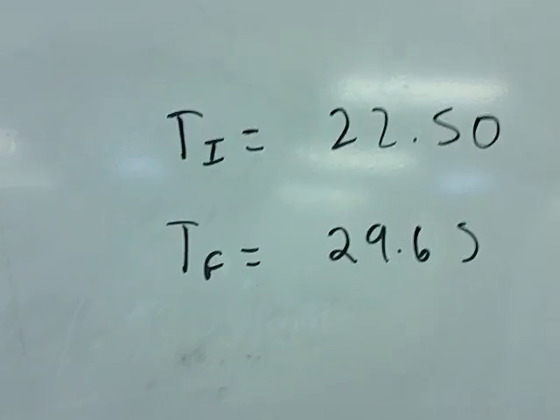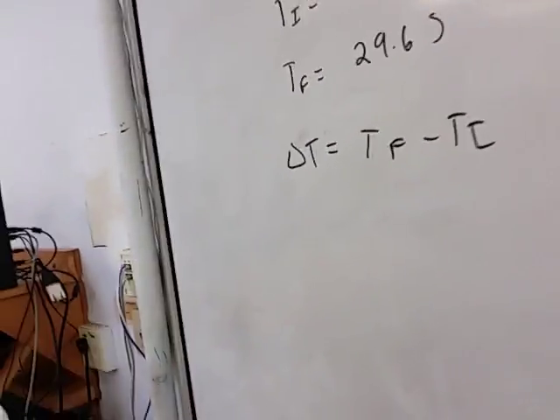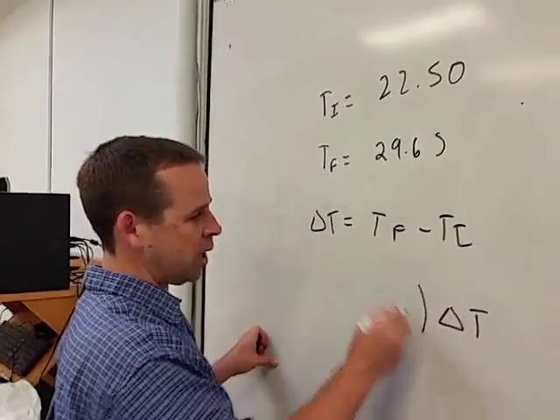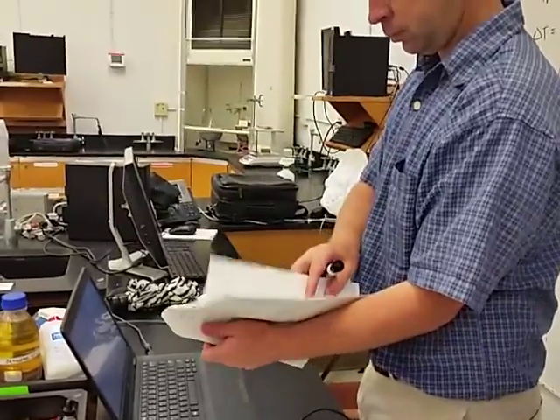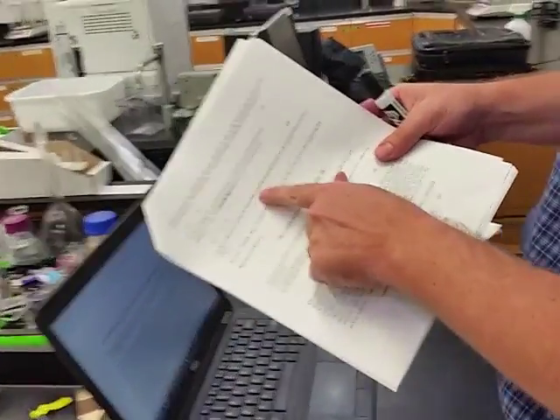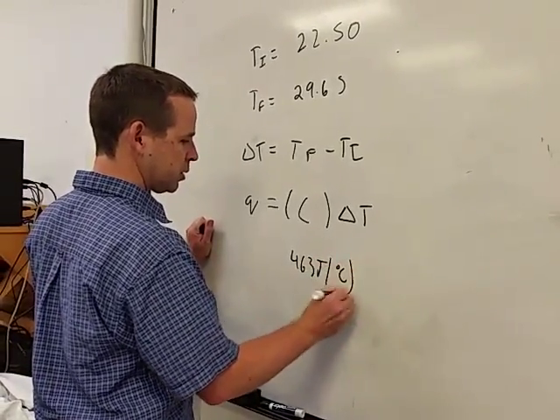So now we have our temperature initial and temperature final, and that's going to give us our change in temperature, which is temperature final minus temperature initial. All right. And that change in temperature, right, this one here, we're going to multiply by our heat capacity to find out how much heat was released in this process. Okay? And the lab here on the second page, the heat capacity for this calorimeter has a value of 463 joules per degree Celsius.